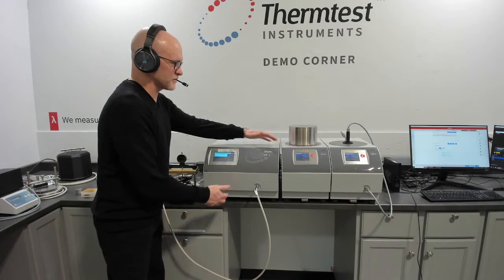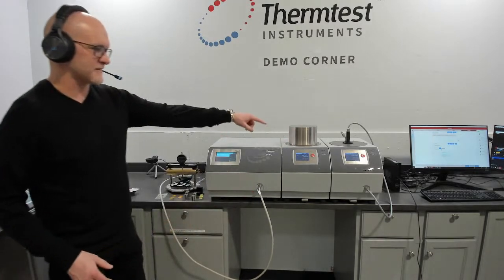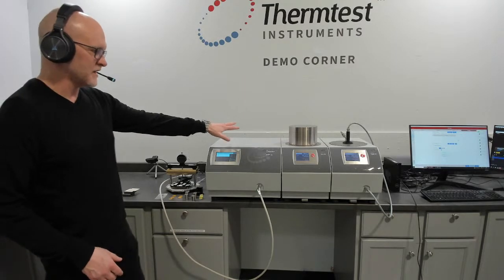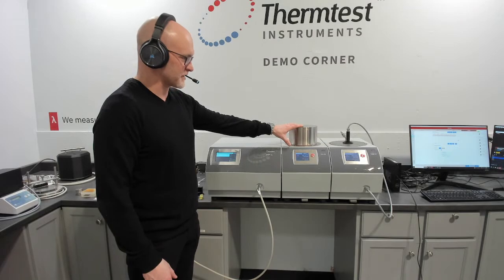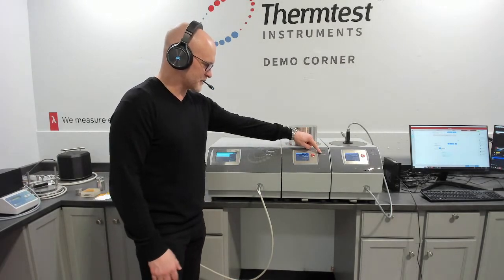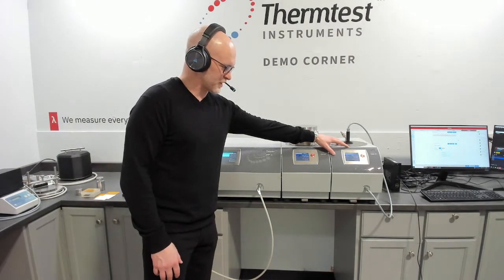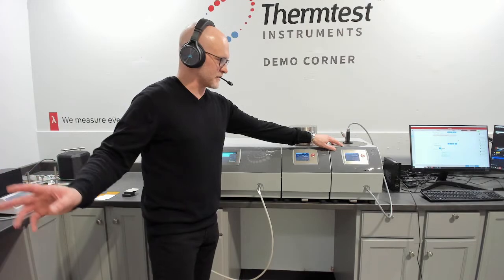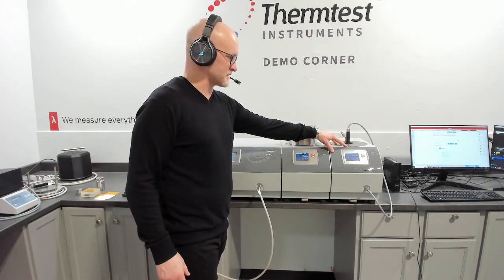So it can be configured for just room temperature. This would be the controller if you just want a room temperature configuration. If you wanted the ability to add temperature to your testing, these are our temperature platforms. So this one right now is configured for 0 to 300. There's no external cooling. This is TPS temperature platform which is transient plane source. This is the temperature platform. So integrated temperature control like the transient hot wire L1 for measuring liquids and phase changing materials.